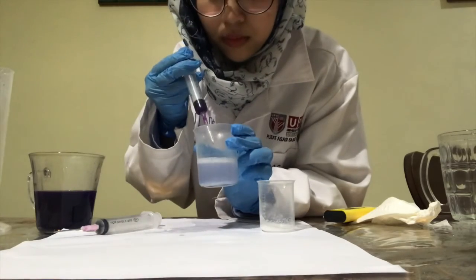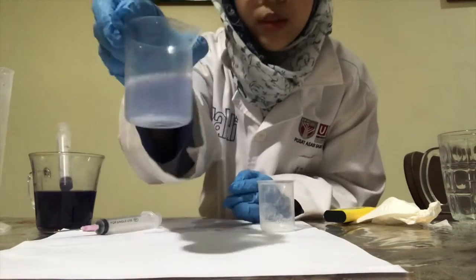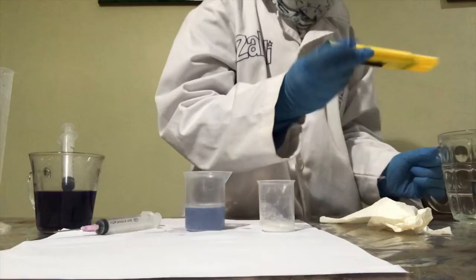Then, another 5 ml of the titrant added into the analyte to over-titrate.